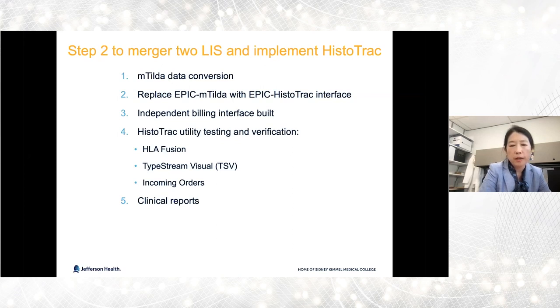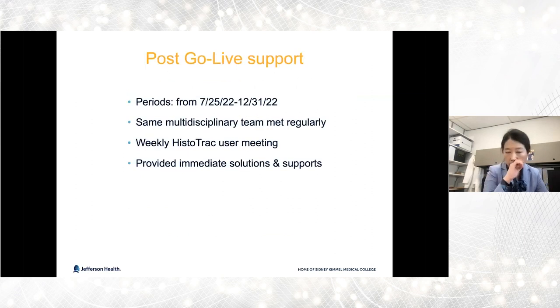We made a lot of changes. We consolidated the old clinical reports and made them more straightforward. So the second go live was on July 25, 2022. Then right after the second stage go live, we moved to post go live support. It pretty much started right after the second stage until the end of 2022.